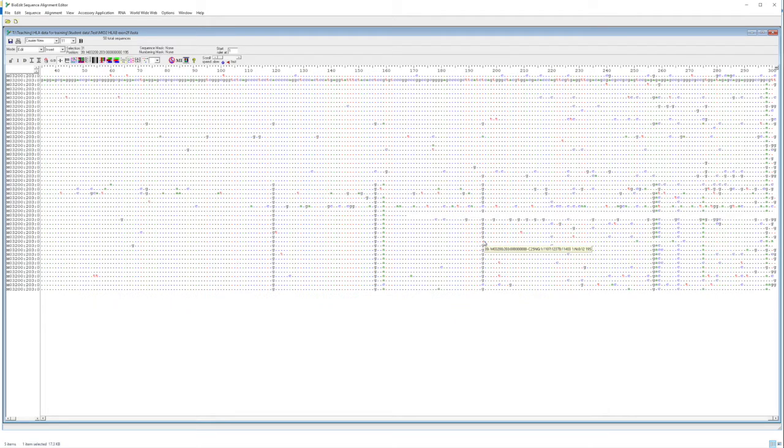So what's happening here? Well, this is not a sequencing error. This is something which has probably occurred in the PCR. And these reads represent reads which have part of one allele and part of the other allele. They're what's called a recombinant. And it was probably formed during the PCR process. I won't go through any details for that because you probably would have gone through that elsewhere.